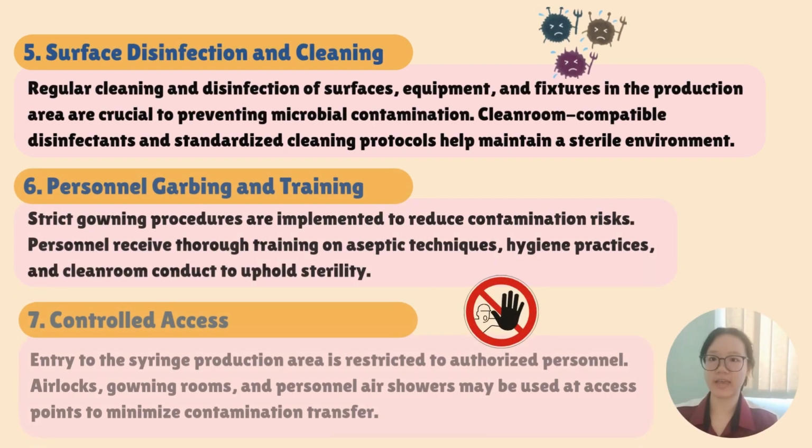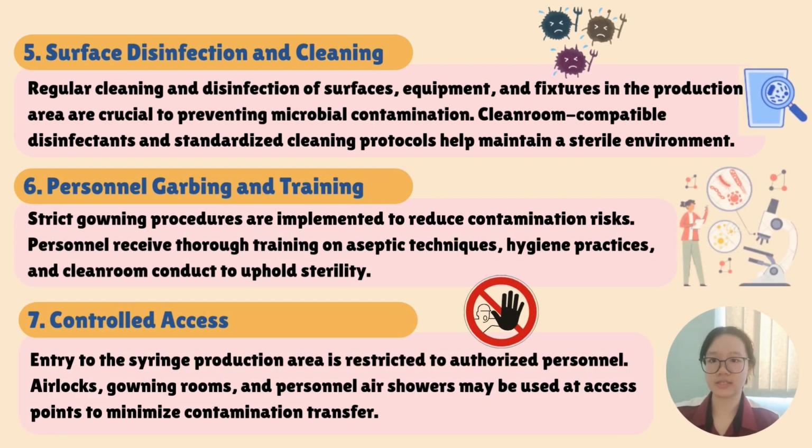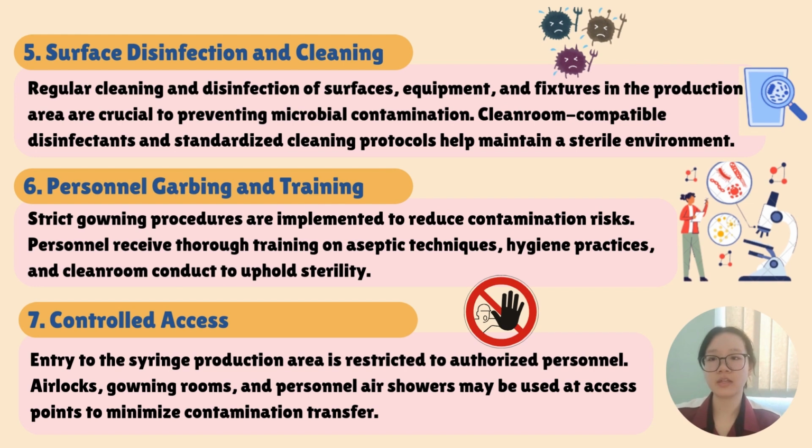The surface disinfection and cleaning. Regular cleaning and disinfecting of surfaces and equipment can prevent microbial contamination. Clean room compatible disinfectants and standardized cleaning protocols maintain the sterility. Then the personnel gowning and training. Strict gowning procedures and thorough training in aseptic techniques and hygiene are essential to minimize the contamination risk and maintain the clean room integrity. Finally, the control access. Only authorized personnel can enter the syringe production areas. Access points like airlocks and air showers can help to reduce contamination transfer.